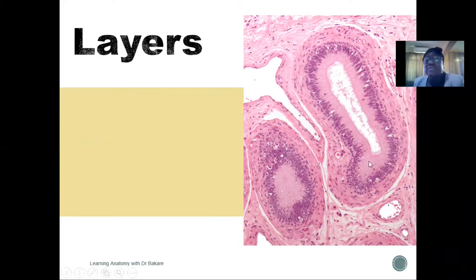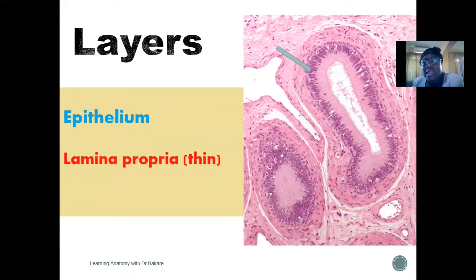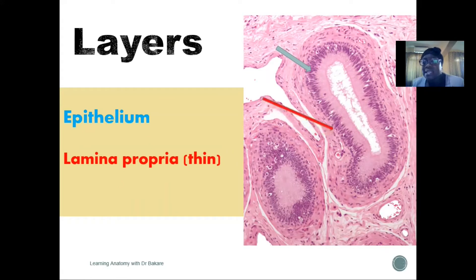If you look at it, you see rounded arrangements, and this represents the tubular foldings of the epididymis. The layers of the epididymis are made up of the epithelium — the epithelium is the innermost layer, and this is the layer that forms contact with the lumen. This is the central lumen of the epididymis, and this is the epithelium lining. The second layer where the epithelium lies over is the lamina propria, which is a thin layer creating a platform onto which the epithelium stands.